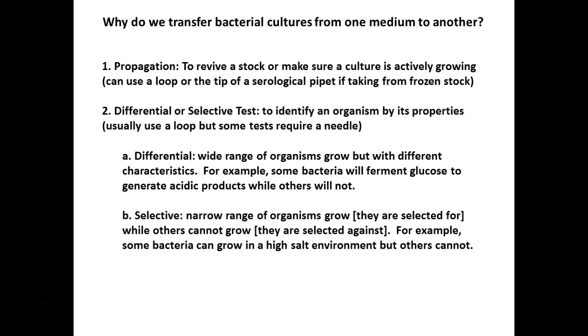Actually, the media that we use later on that's selective is also differential. So you can do both at the same time. You can select and differentiate. But then, of course, the ones you're selecting for, then you can differentiate them into different groups. If you kill it, can you tell if it can do something? No.